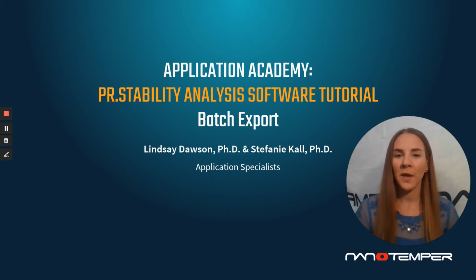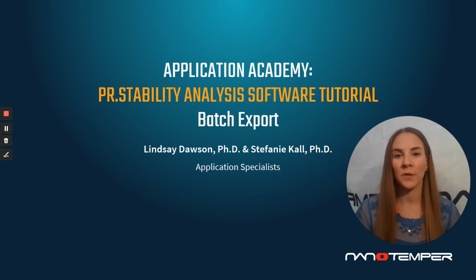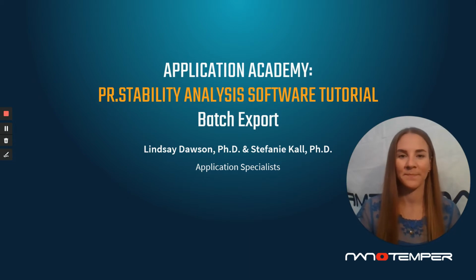In order to do that efficiently, we've provided you a ton of options for different exporting in the software to be able to quickly export whatever data you need to meet your analysis needs. Let's go ahead and jump into the software and check out these export options.